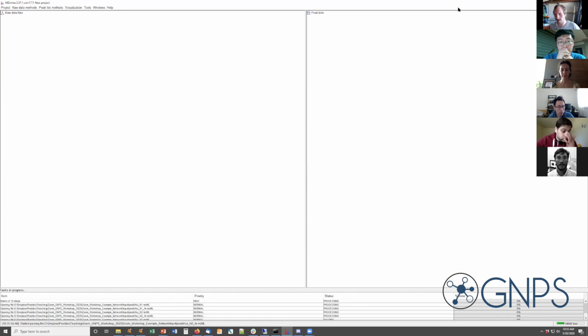All right, I think it's actually a great idea to go through some of the exercises. There's also a visualization function in GNPS, so we did not cover that at all. But you can also import the GNPS outputs back into MZmine to visualize networks here, but that's all on a very beta level. There's definitely a lot of things to explore.